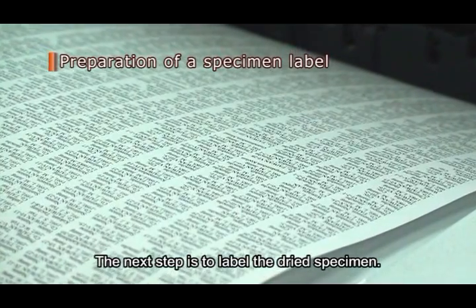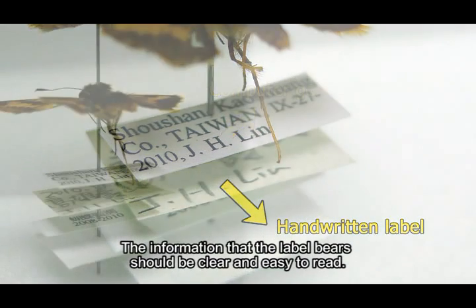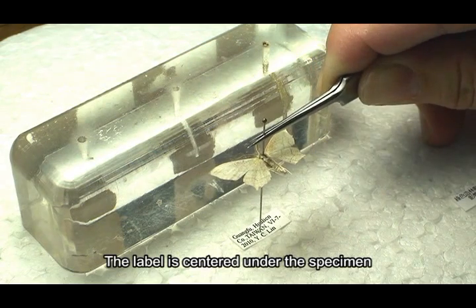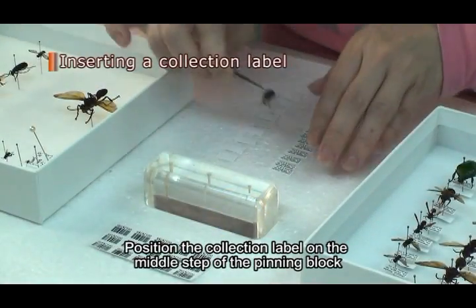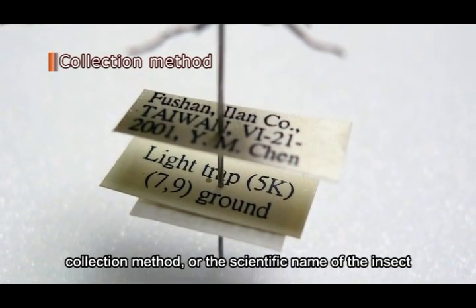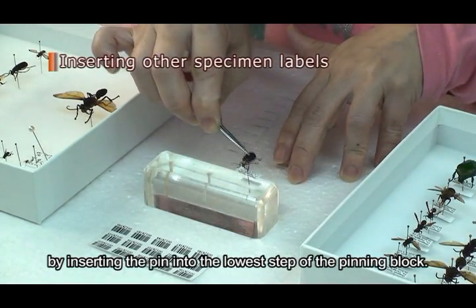The next step is to label the dried specimen. The paper used for making labels should be heavy enough that the labels remain flat and do not rotate loosely on the pin. Labels must be printed in high-grade ink that will not fade over time, and the information should be clear and easy to read. The first label, or top label under the specimen, is the collection label and should contain basic information such as the locality, date of collection, and the collector. Position the collection label on the middle step of the pinning block so all collection labels are at a uniform height. Additional information such as the host of the insect, collection method, or scientific name may be recorded on the second or third label, oriented and pinned the same way, and moved to the desired height using the lowest step of the pinning block.